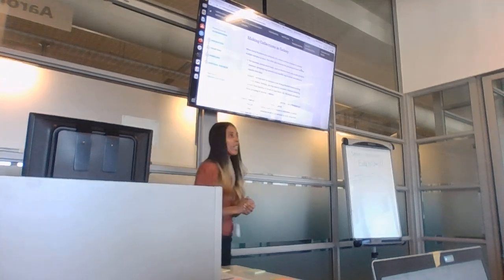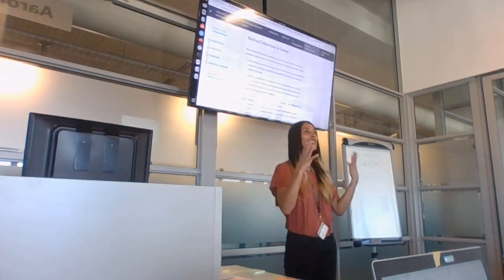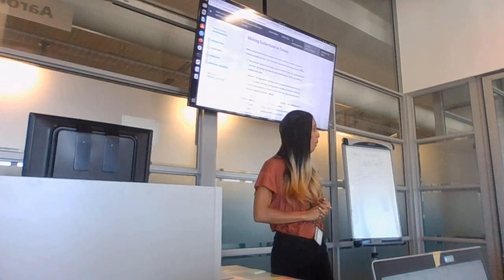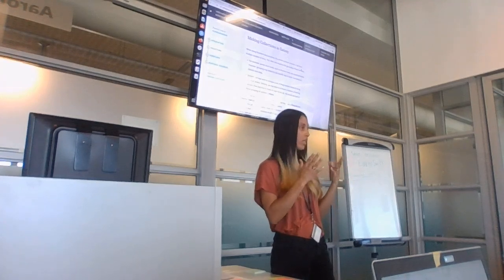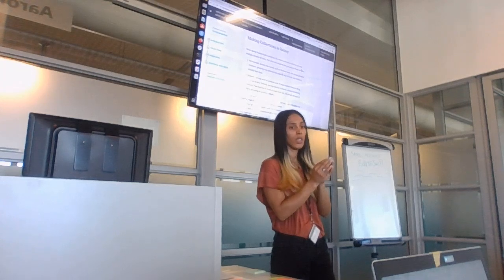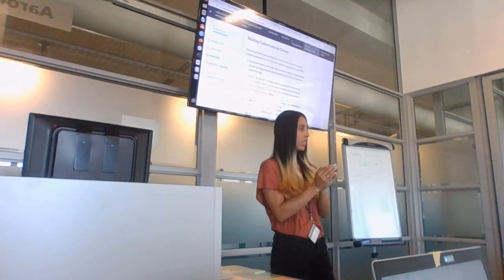So if I have a collection of FASTQ files, like samples, and I put them all into a directory or folder, right?